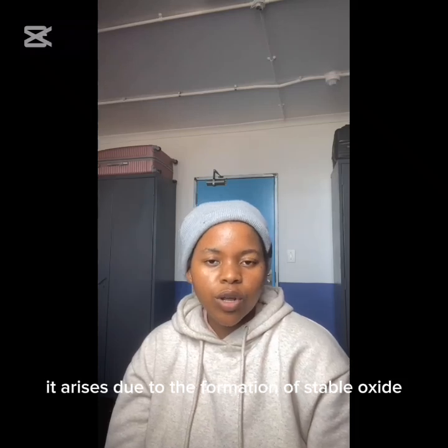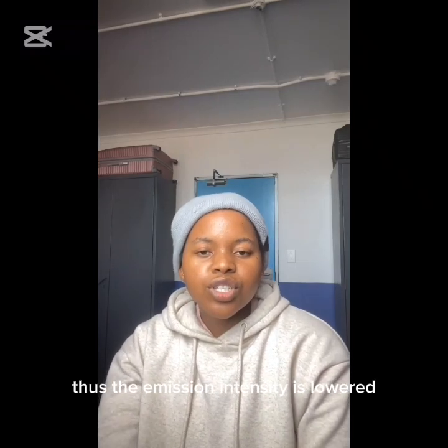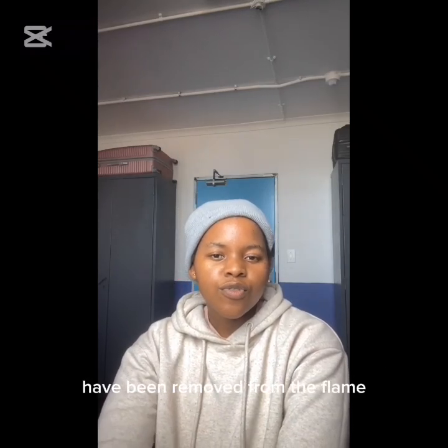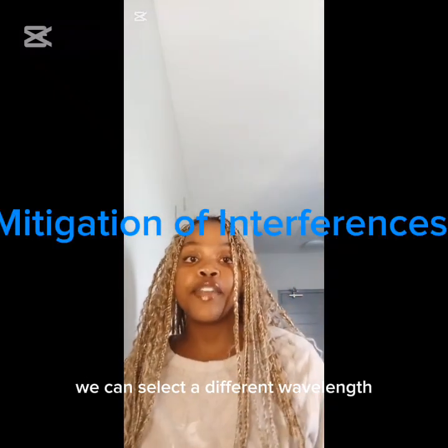Oxide formation. It arises due to the formation of stable oxide with free metal atoms if oxygen is present in the flame. Thus, the emission intensity is lowered because a large percentage of free metal atoms have been removed from the flame. In spectral interferences mitigation, we can select a different wavelength.